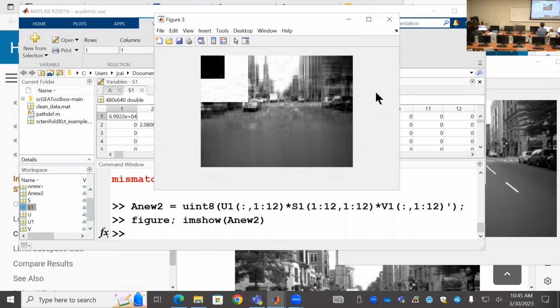So you have to look at the values in the U and V matrix. The U matrix contains information for the rows, and the V contains information for the columns. That means those could be the cells, or the genes, depending on your input.